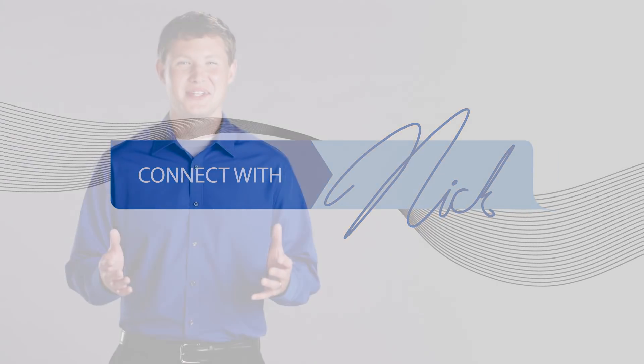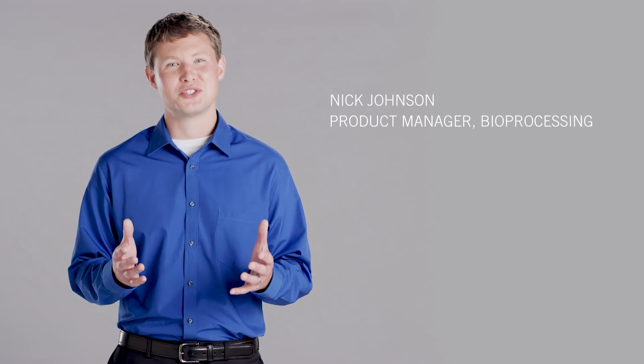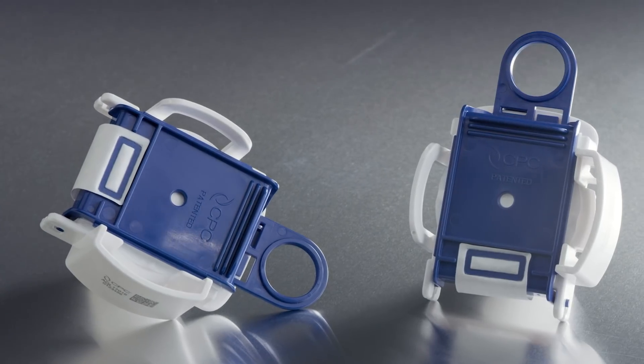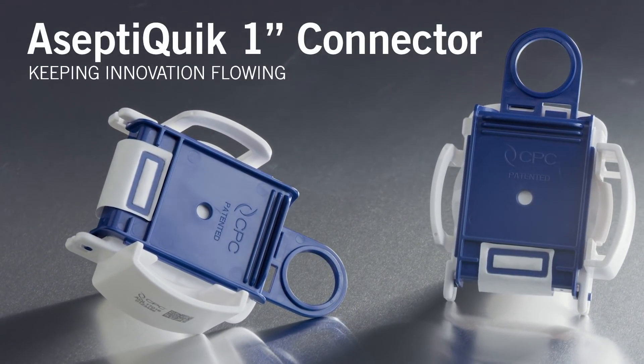Hello and welcome to Connect with Nick. I'm Nick Johnson with CPC and I'm here to show you how CPC is taking genderless connectors up a notch. Robust and reliable, the AseptiQuick family of connectors provides fast and easy sterile connections. And now we're getting bigger by introducing a genderless one-inch large format connector.